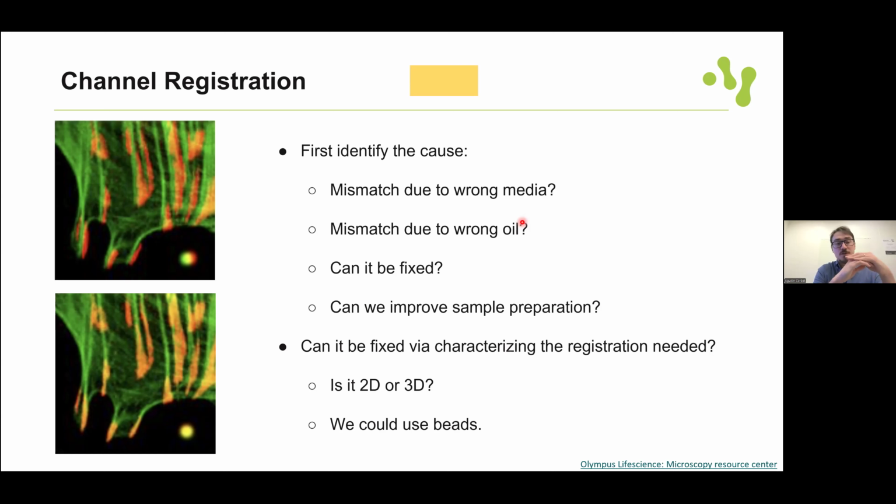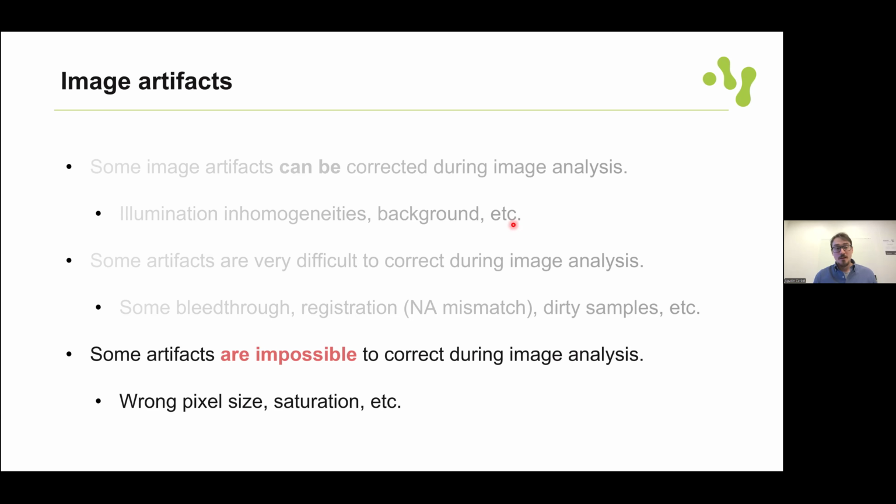between your plane of acquisition and your objective. And this is often very hard to characterize, even impossible. So I really advise you to work on sample preparation before this. And there are some other artifacts that are actually impossible to correct during image analysis.